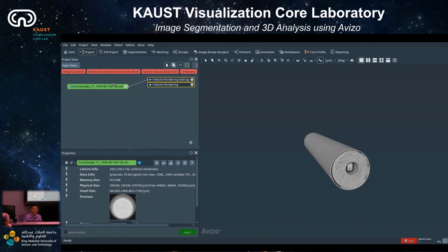Just stitch them. Yeah, exactly. If you have a few sections together, you stitch them, and then the alignment is really easy because now we port the crop core to here, so you can see this. So this is the core.